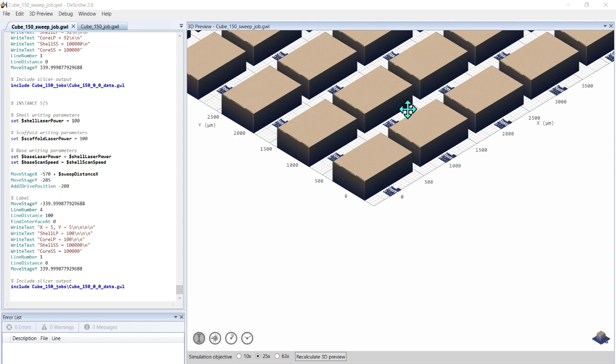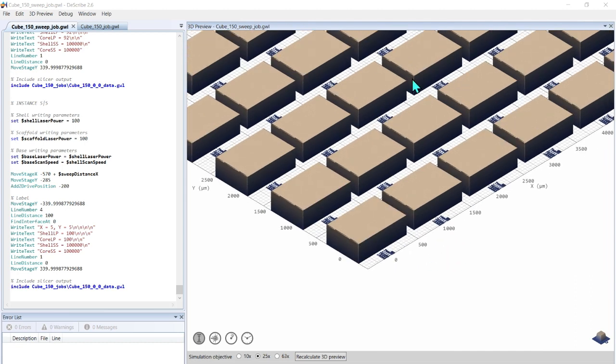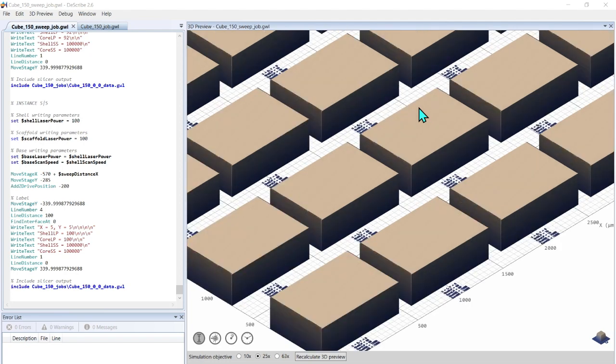So this is the way you will be adjusting your processes whenever you use a new structure, or you change the photoresist, or you change maybe anything that is a change in your process. You should be doing this first run to adjust the conditions, okay?